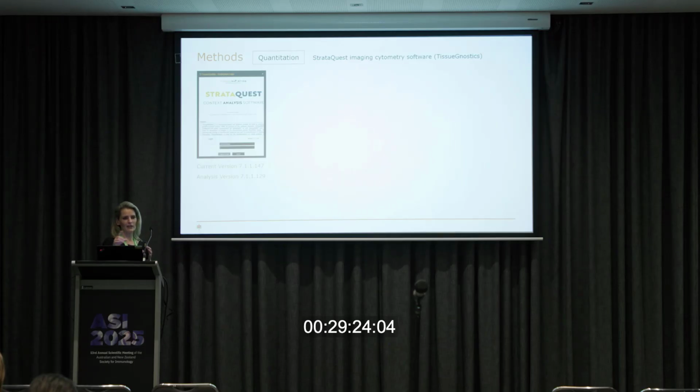And the reason I mention that is I'll kind of do a side quest showing you a difference in the nuclear segmentation with the new version that we now have and that I'm now using on some PhenoCycler data. So our version's a little bit older.